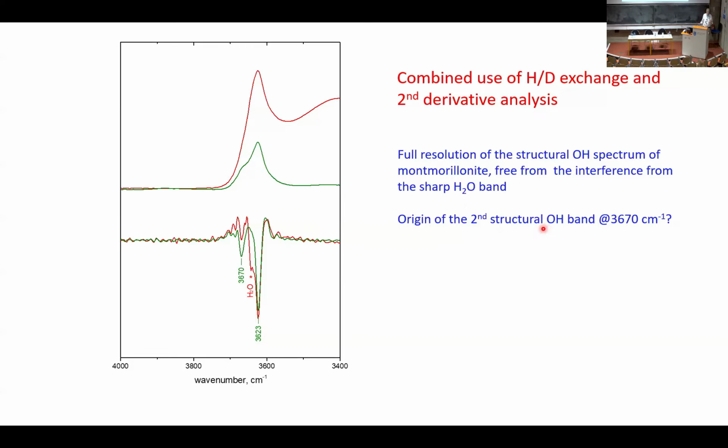we went a long way together. I want you to know that ATR and near-infrared can study your sample as is. They allow you to change the conditions of the sample. They allow you to do reactions on the sample. You could introduce, I didn't show you, temperature as an additional variable if interested for doing reactions. You can do that in situ. So you may want to try them one day.